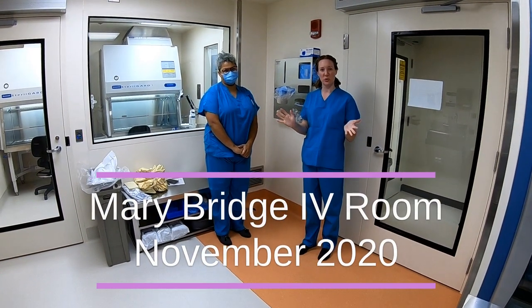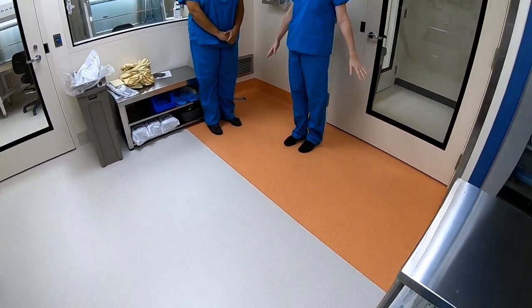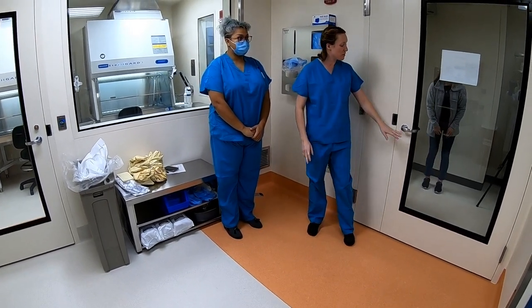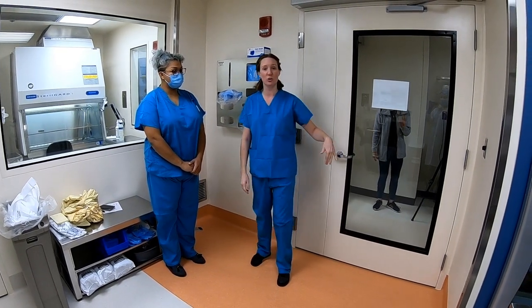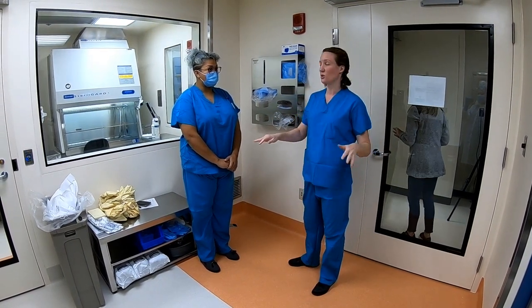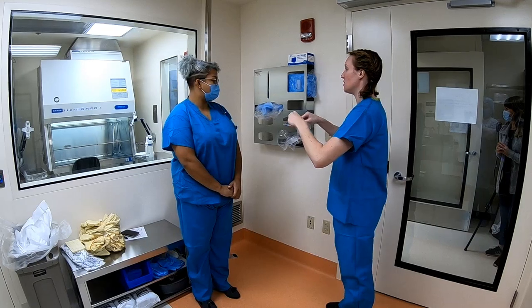Welcome to Mary Bridge IV room. This is an introduction to everything. The line of demarcation has been manually marked with orange — you need to be fully gowned up before you cross the line. The door is very heavy and aggressive; when it opens and closes you need to get out of the way. It will keep opening and closing — that's true of all the doors. When you walk in, you have your PPE station, so go ahead and get gowned up with a fresh mask.